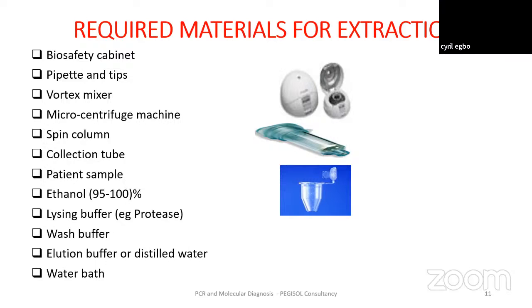Then you need the reagents, which are the lysis buffer, the wash buffer, the elution buffer, or sterile water. You equally need a water bath. So these are the materials that are required for this DNA extraction.